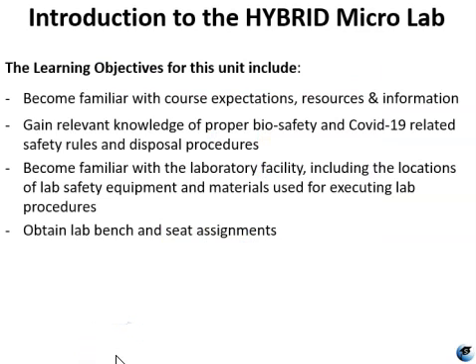This is a hybrid course that is broken up into 10 separate lab sessions. Each lab session has its own specific learning objectives. The objectives for this unit, though, are becoming familiar with course expectations, resources, and information. You're going to be gaining knowledge of biosafety and COVID-19 related safety rules and disposal procedures.